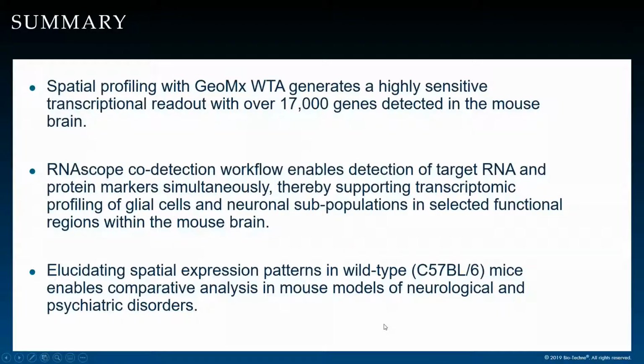And so by using pathological models, we can study targets that can eventually be used for therapeutic purposes and provide functional information in certain regions of the brain that are still undiscovered and novel. So there are a lot of applications of this joint workflow in neuroscience and in many other research areas.